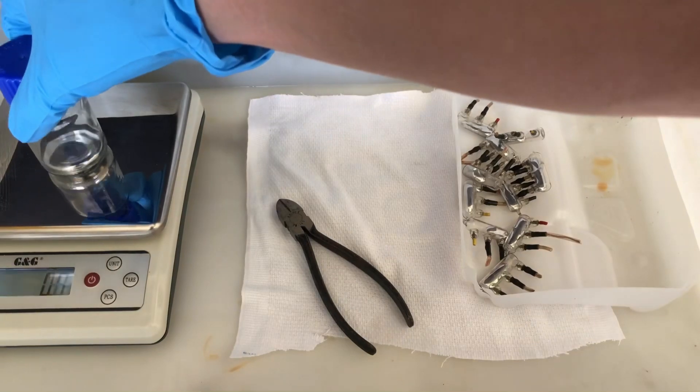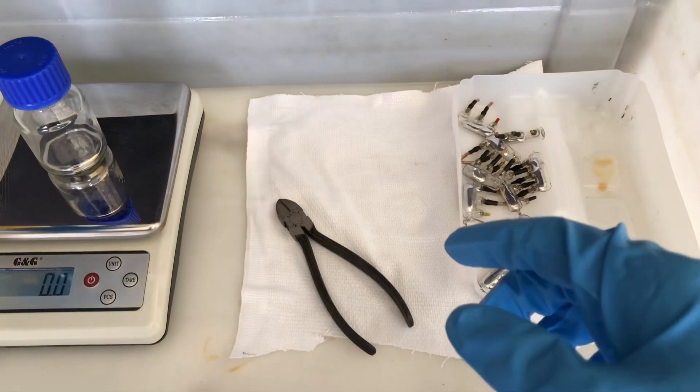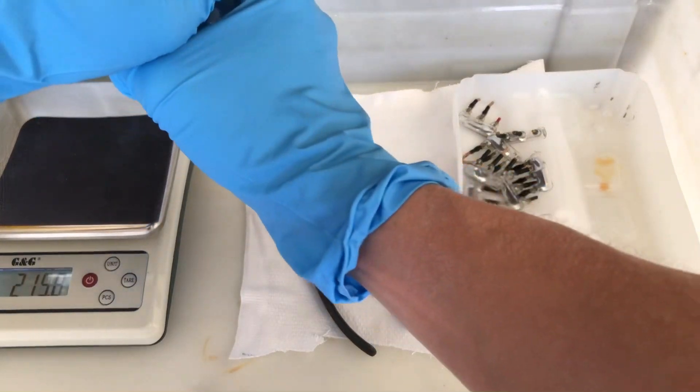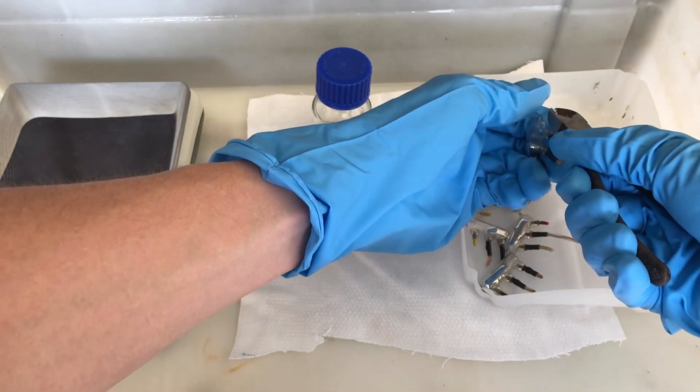I have a glass that already contains some mercury and we wanted to know how much mercury each switch contains. Therefore the glass was weighed beforehand. To get out the mercury, the tilt switch was snapped open using a pair of pliers.